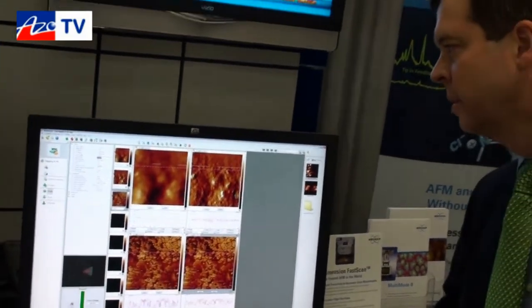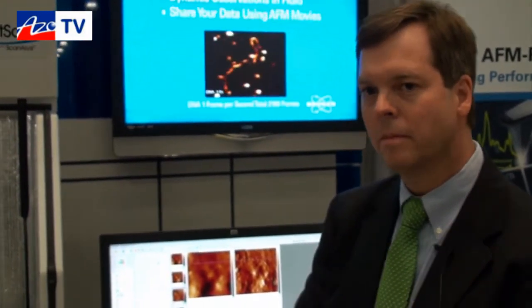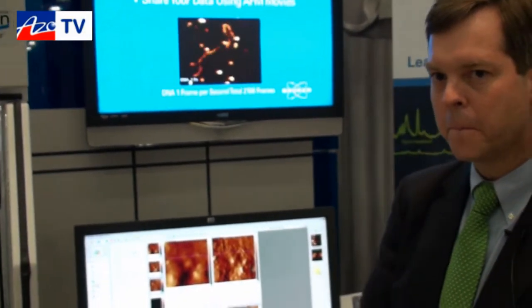It's very easy to use. As far as running it, it becomes very similar to just running regular tapping mode — setting gains, setting up your set point — all very similar. So if somebody already has AFM experience, they're already going to know how to do that. Pretty straightforward. John, you were saying it can scan up to 100 times faster than a conventional AFM — do you lose any resolution? Our claim is that it can scan 20 times faster with the same force control, same resolution as you would get with a slower scan, and same ease of use with no increase in complexity.